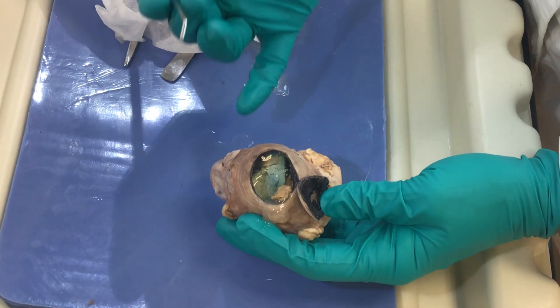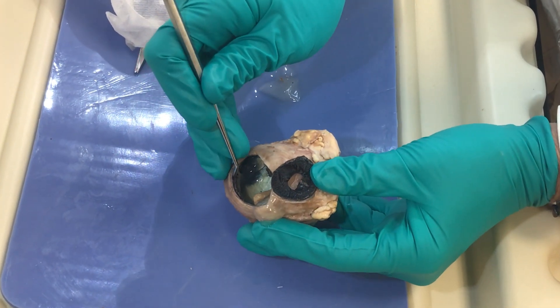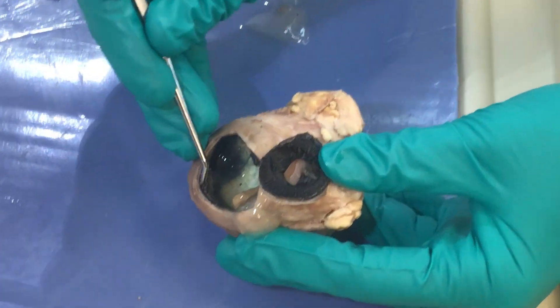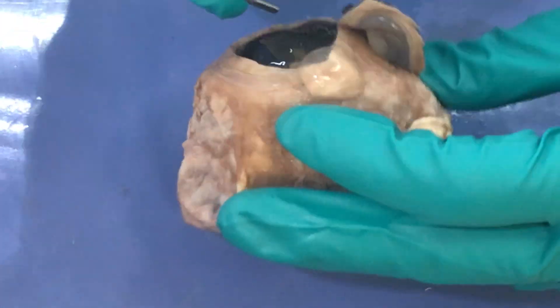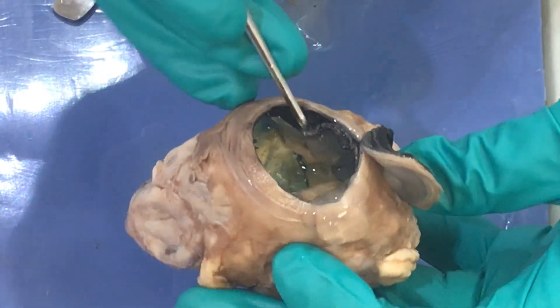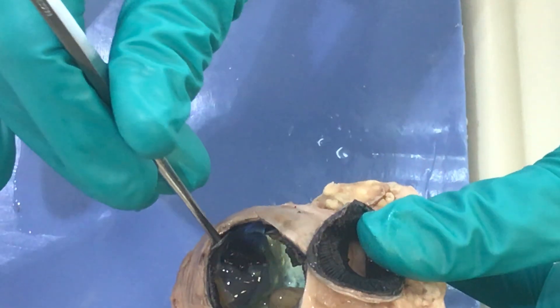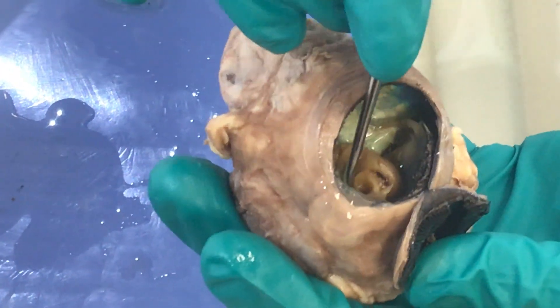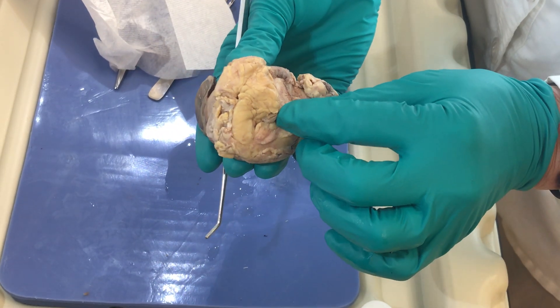To orient again: we have our retina, which is the inner layer; the choroid, which is the dark pigmented layer with vessels; and I'm going to attempt to separate that away from the sclera. The sclera is the tough white outer layer. I'm lifting up the choroid — this tan stuff is the retina. Where the retina leaves the eye is called the optic disc, and those axons leave as the optic nerve.